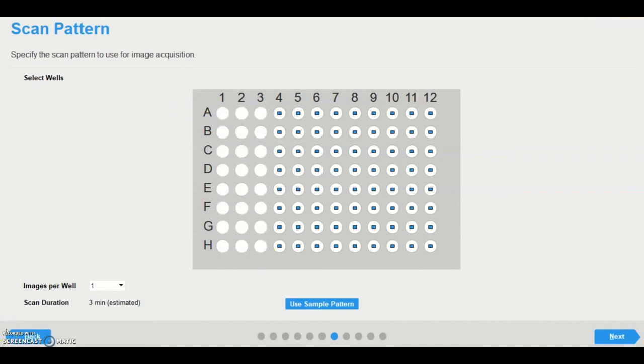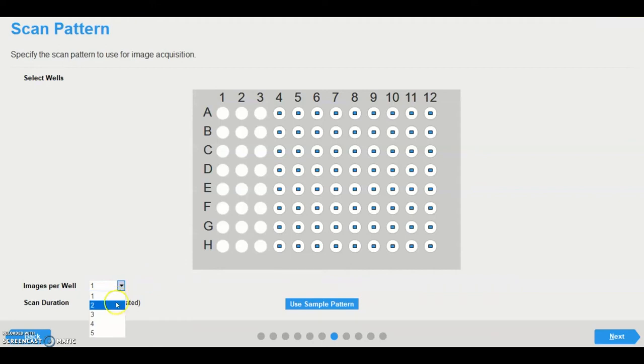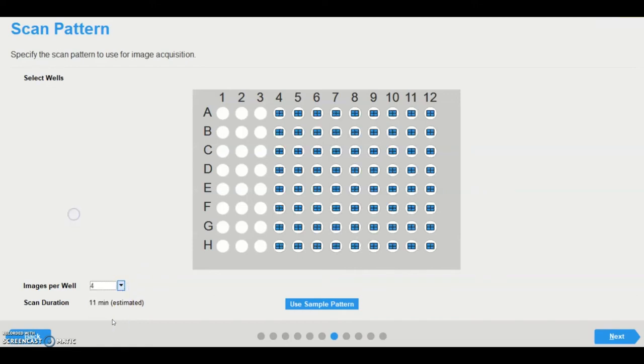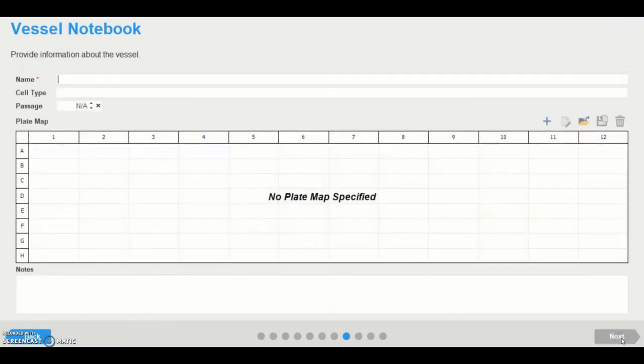Next, the user can specify the number of images that are to be acquired per well. Generally, it is recommended to acquire two images per well for adherent cell types or homogeneously distributed cells, and four images per well for suspension cell types, in a 96 well plate with the 10x objective using the standard scanning mode. The estimated scan duration, based on the chosen scan settings, is displayed at the bottom of the page.